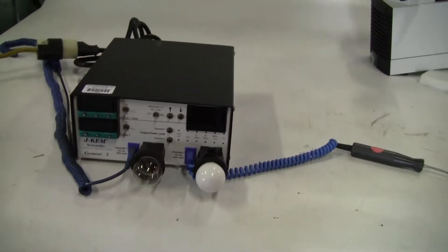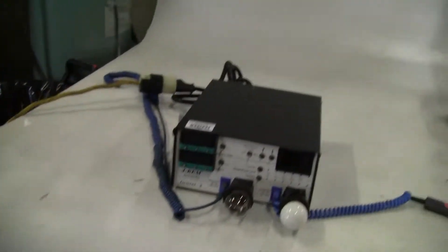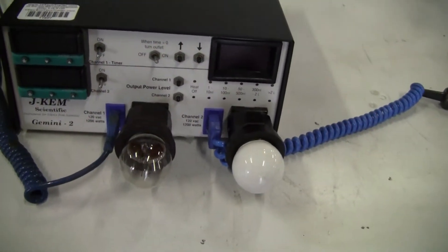Hi, this is Jim from HitechTrader. Today we're looking at a J-Chem Scientific Gemini 2 dual channel temperature controller. We have it hooked up to our T-type thermocouples.